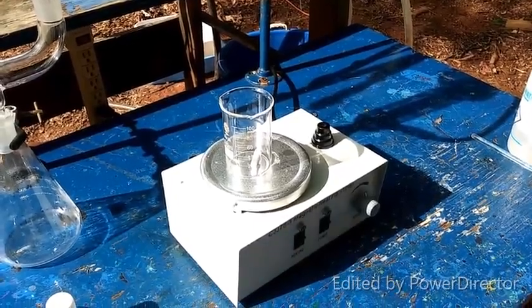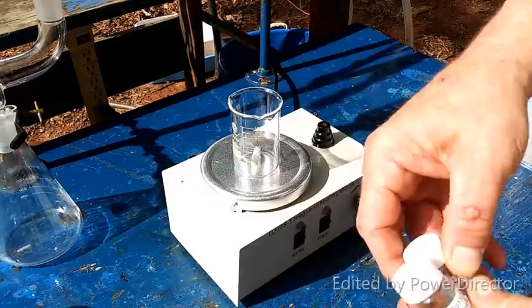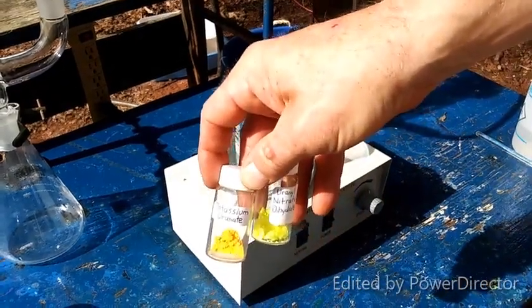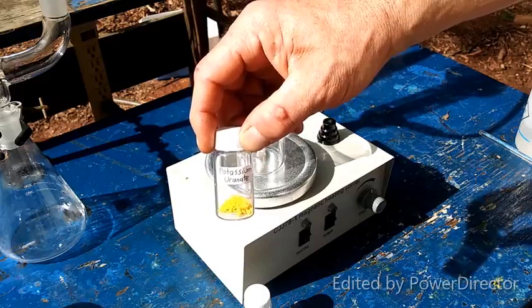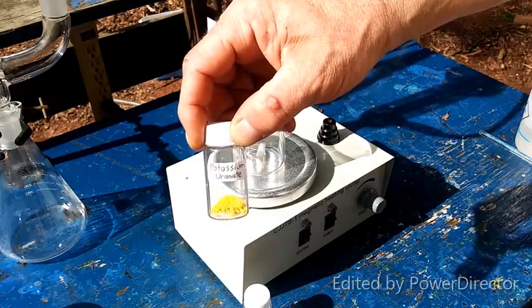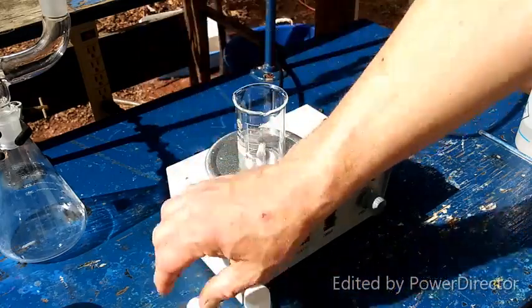Cool. What we're going to do first is create a solution of potassium uranate and uranyl nitrate. So we have both of these right here. This is the potassium uranate that I made by fusion of potassium chloride and potassium nitrate with uranium trioxide. So I made that in that video.